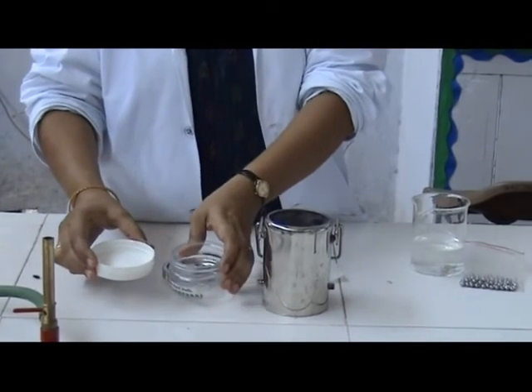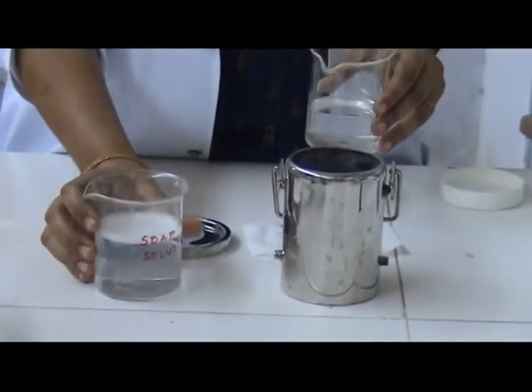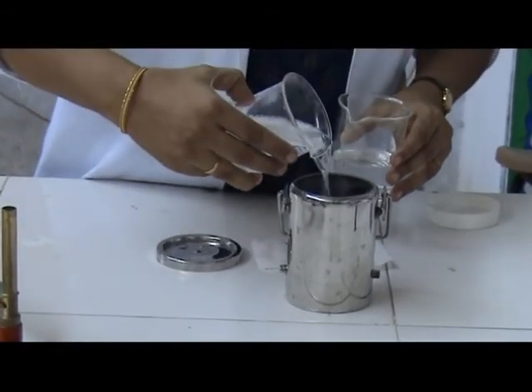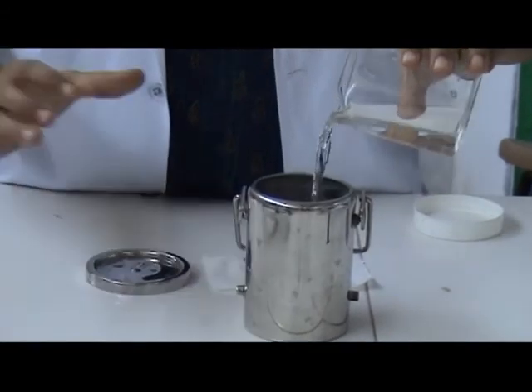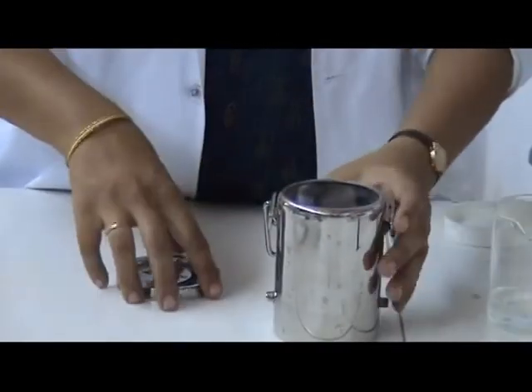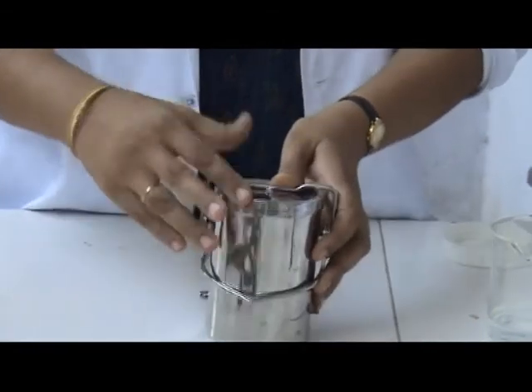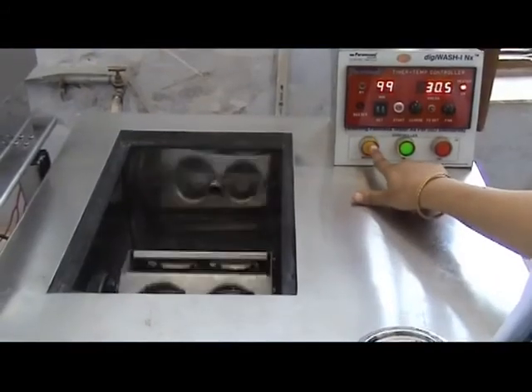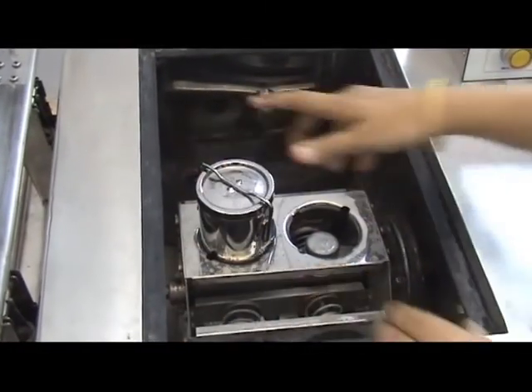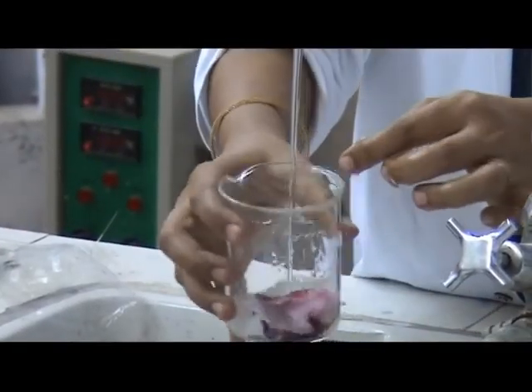Test number 4. In this test, the sample is placed in the Laundrometer together with 10 stainless steel balls of specific size and sufficient solution containing 5 grams of soap and 2 grams of anhydrous sodium carbonate per litre, to give a liquor to material ratio of 50 to 1. The test is carried out at 95 plus or minus 2 degrees centigrade for 30 minutes. The rest of the procedure is the same as for the first 3 tests.